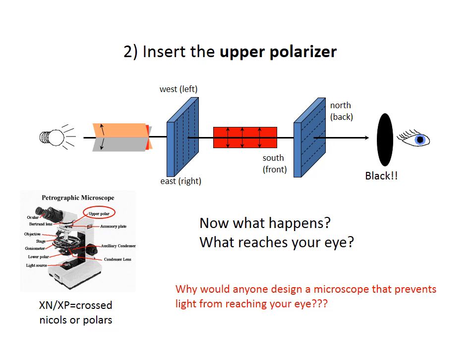Next, a second polarizer between the stage and your eye can be added or removed. This one is called the analyzer, and it's north-south, perpendicular to the first filter. The polarizing filters, or nicols in older terminology, are now crossed. That means all light is blocked and the field of view appears black. So why would this be advantageous?